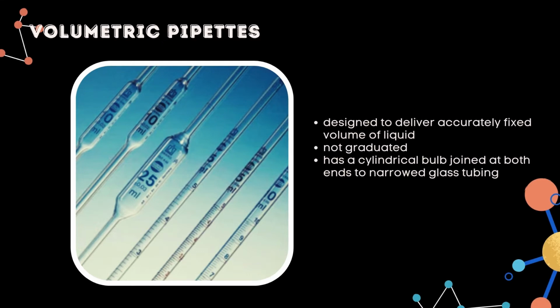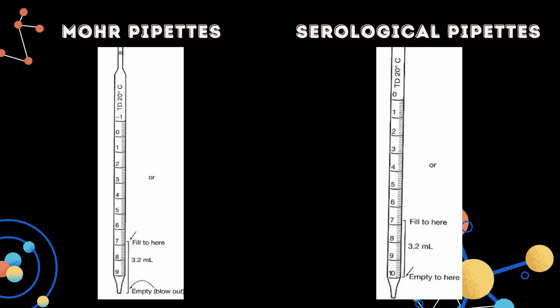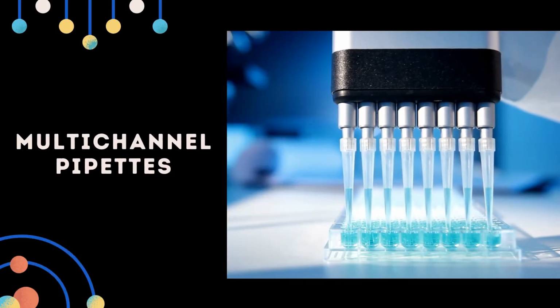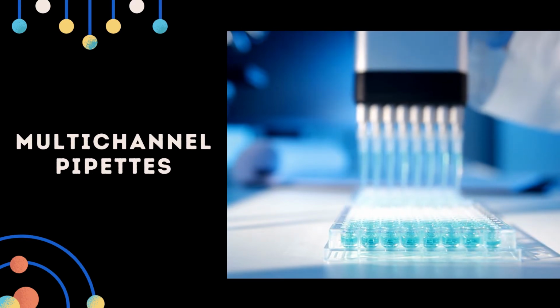Volumetric pipettes are designed to deliver accurately fixed volume of liquid, whereas measuring pipettes can measure a range of volumes. Mohr pipettes and serological pipettes are measuring pipettes. Calibration markings on Mohr pipettes begin above the tip, whereas serological pipettes are calibrated to the end of the tip. Multi-channel pipettes generally come with either 8 or 12 pipette heads, allowing to fill multiple wells at a single time.